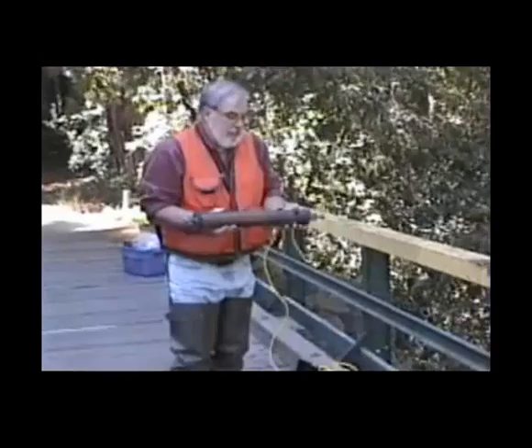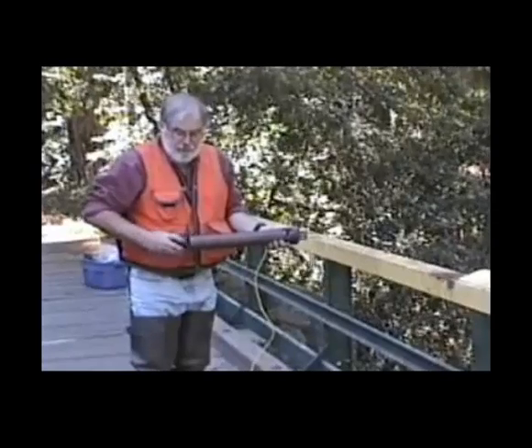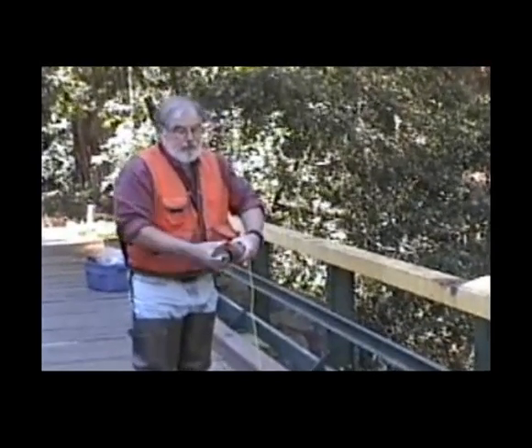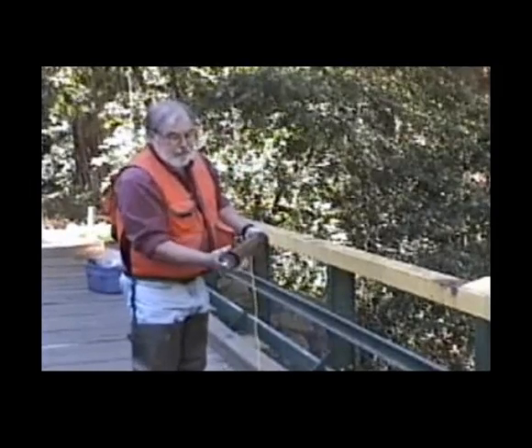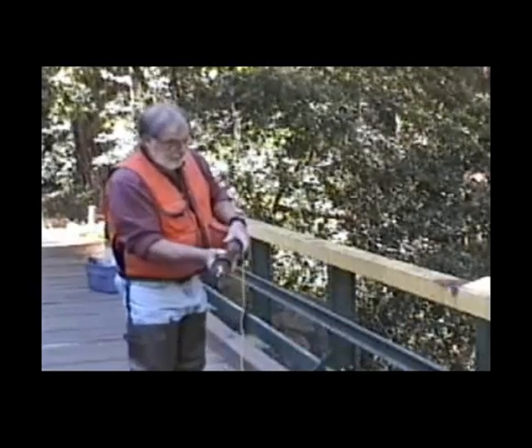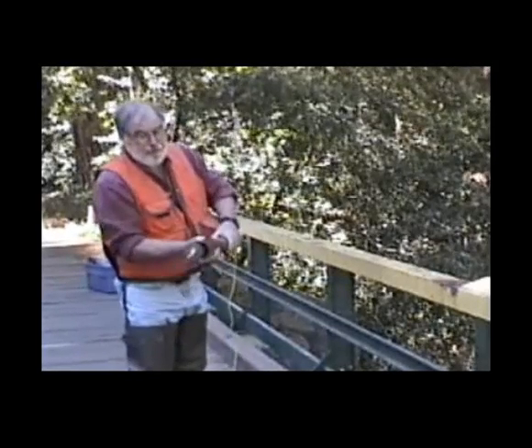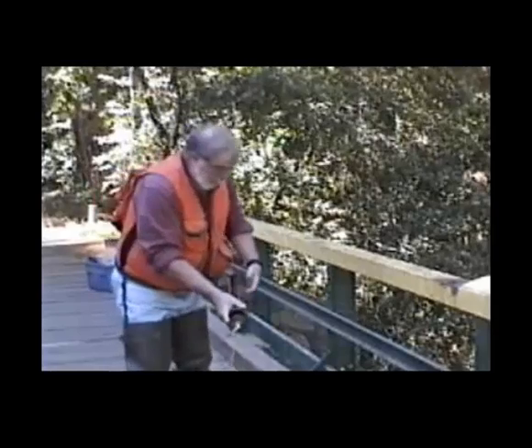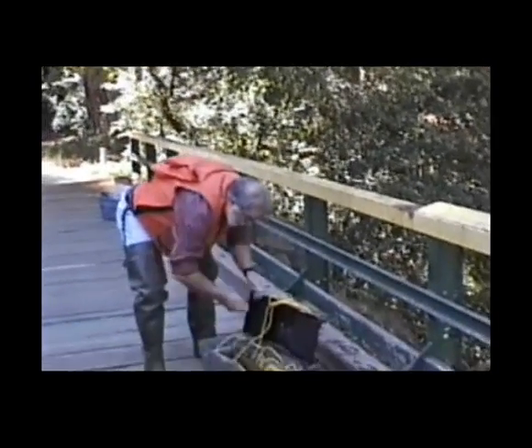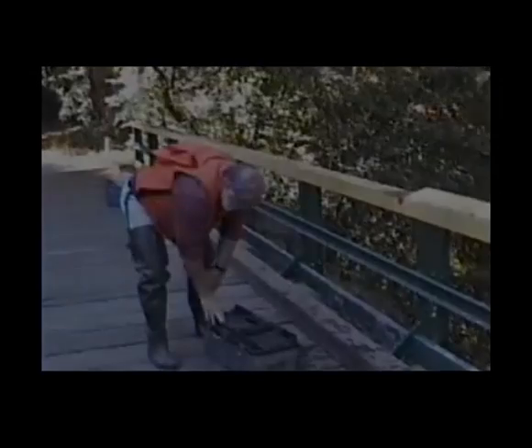After the sampler has been used, it should be cleaned and then stowed with the end caps not touching the interior of either tube, because you don't want dents to be forming in the seals. So the unit is placed back in the case, dried off, and stowed.